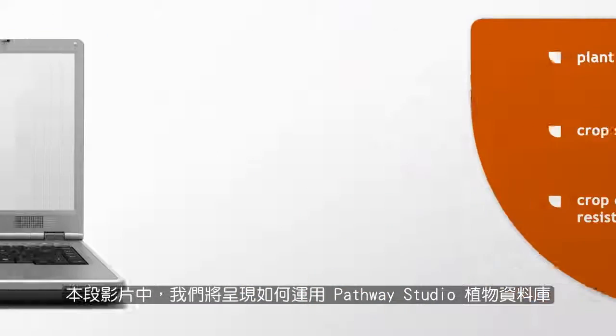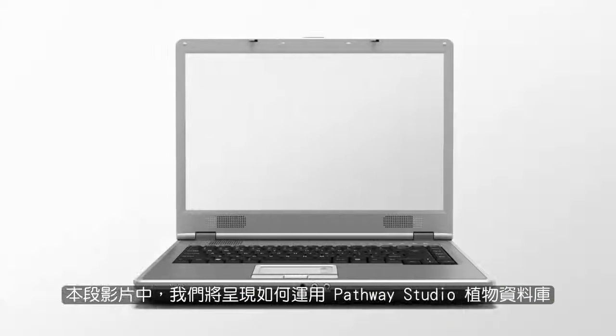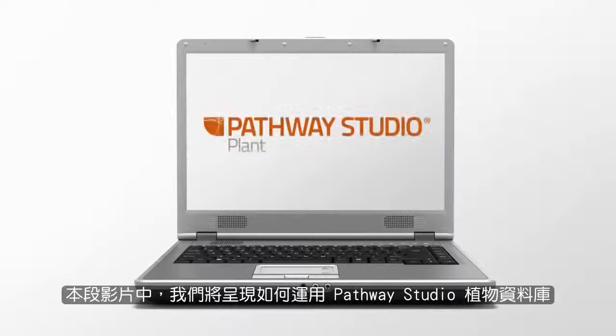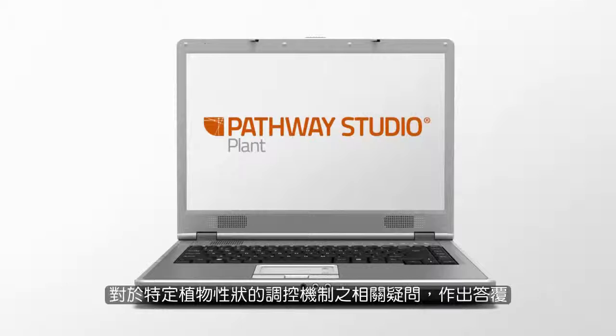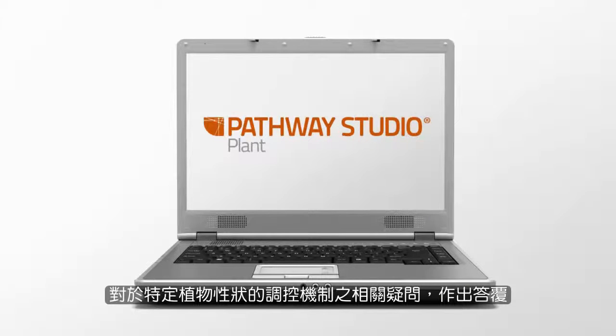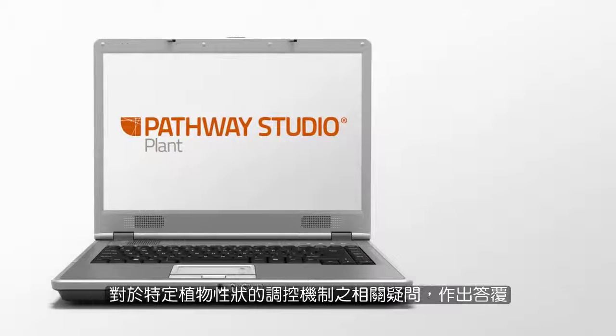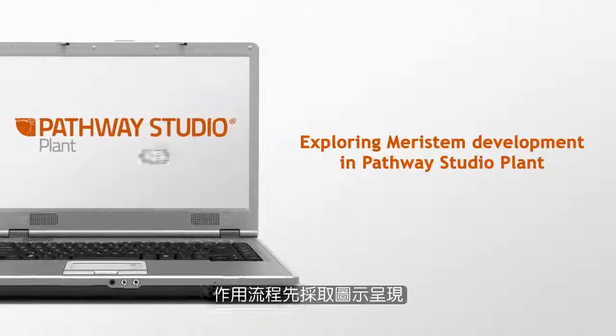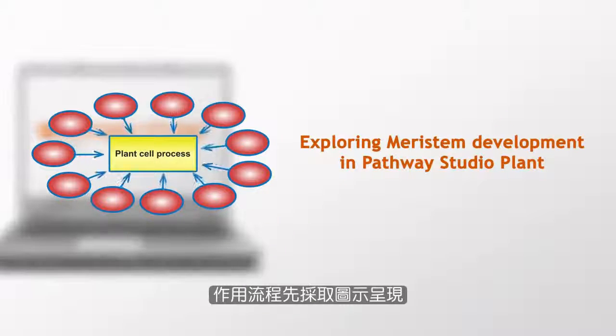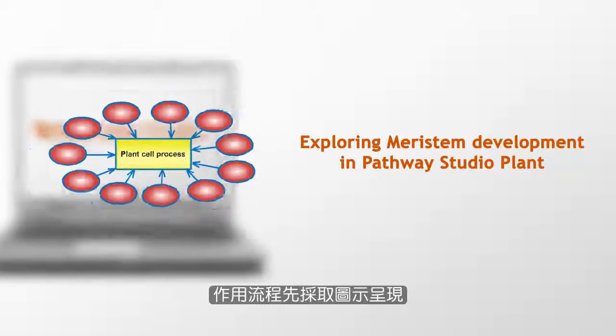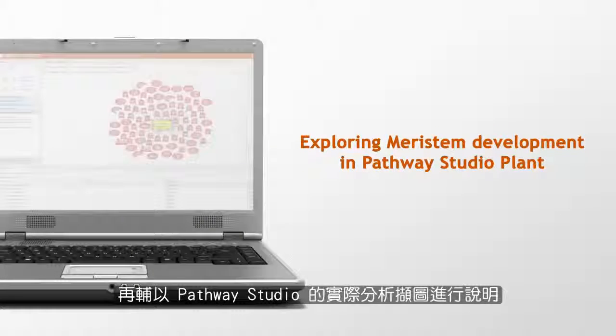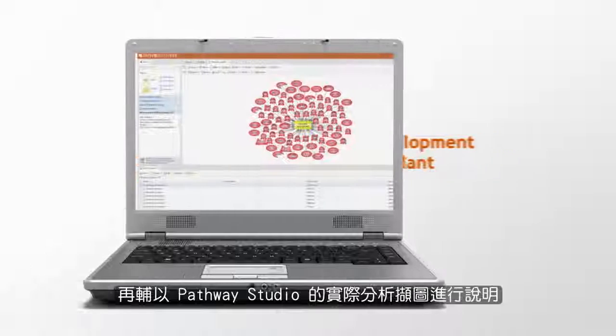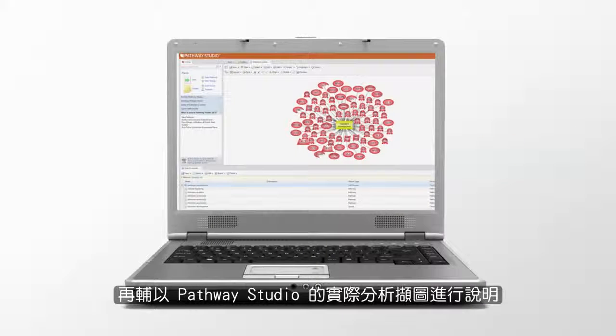In this video, we'll show you how to use Pathway Studio Plant to answer biological questions concerning the mechanism of regulation of a specific plant trait. The workflow is first illustrated, then followed by actual analysis screenshots from Pathway Studio.